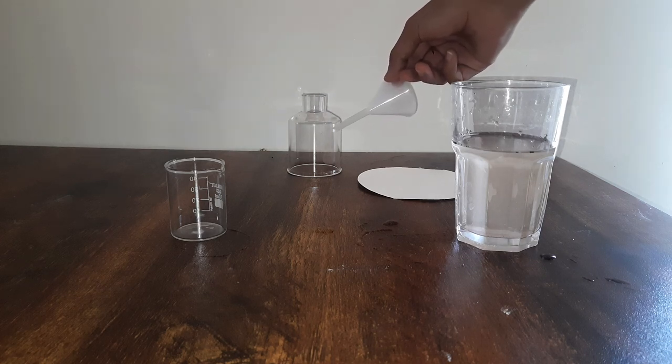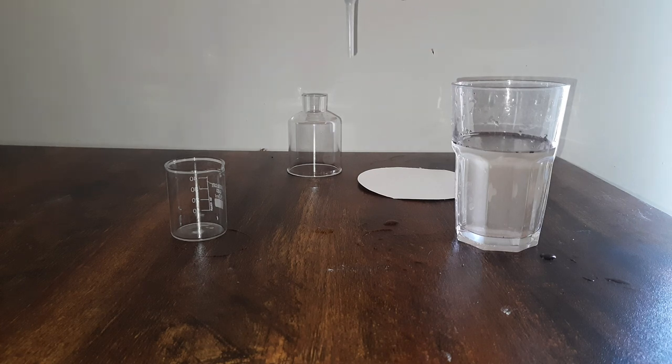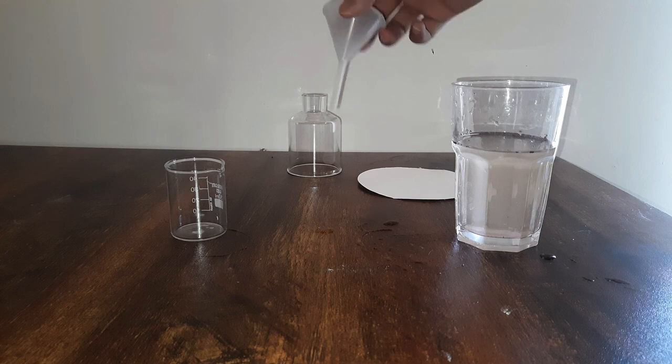For me, this bell jar is doing the work, but if you don't have this, you can still hold the funnel with your hand — though it will take around 5 to 7 minutes — or you can use a clamp stand.